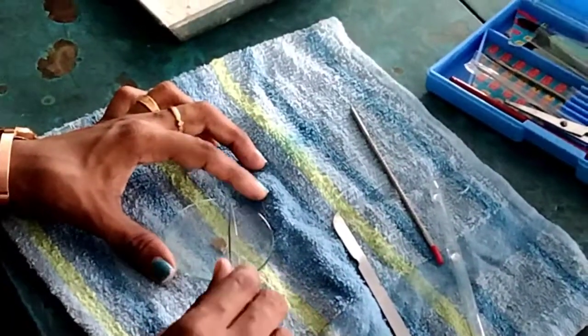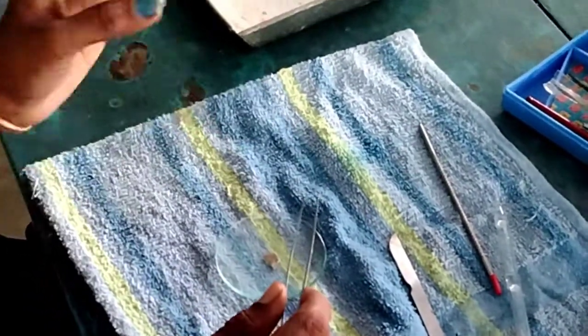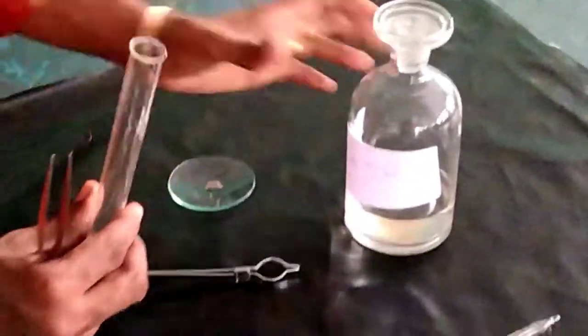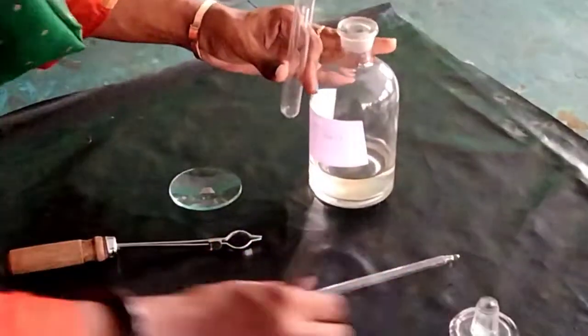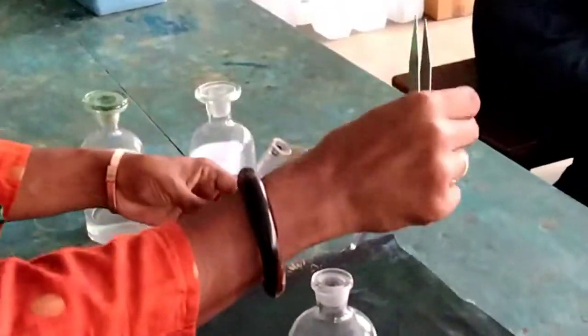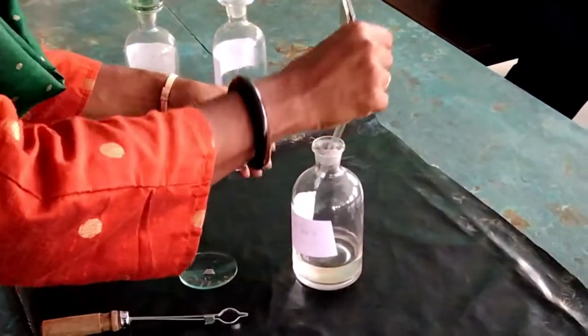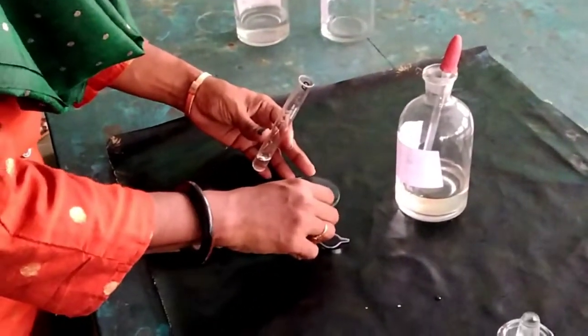Now you can put it into a test tube, add KOH — potassium hydroxide — and then heat it. To clean shark skin you need a test tube, KOH, and a dropper. So you can take some KOH.